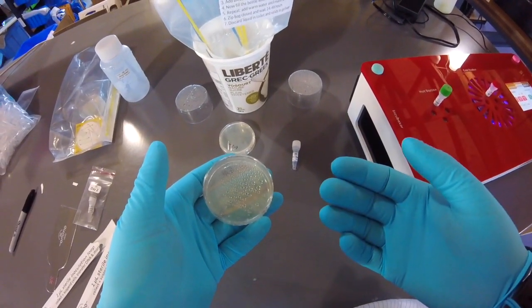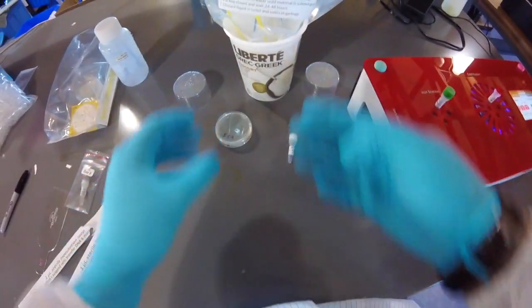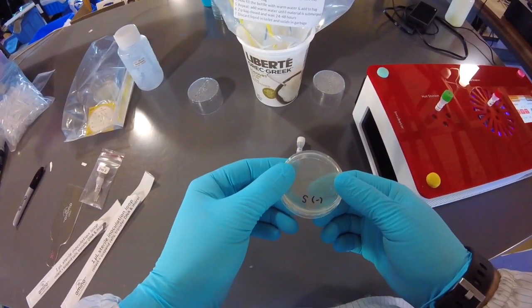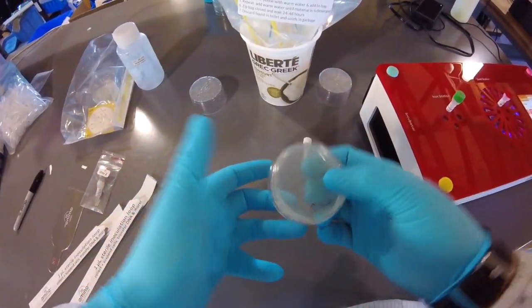So I'm going to go ahead and put that into the discard container. Okay, you don't need to remove the lid because bleach can get in there. The selective plate you can also put in there, the negative control, that's finished. Oh, you can also take pictures of your Petri dishes, right?